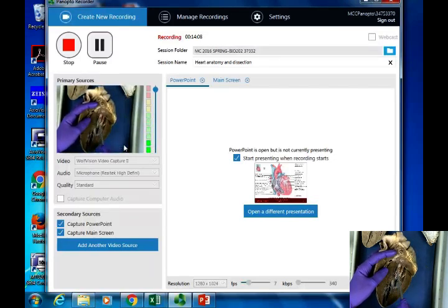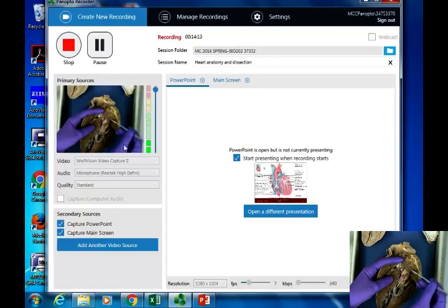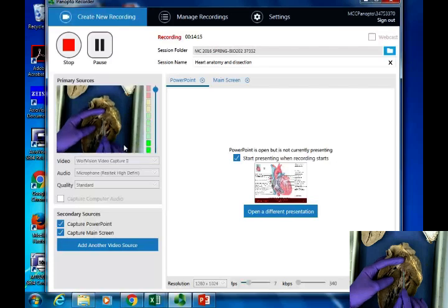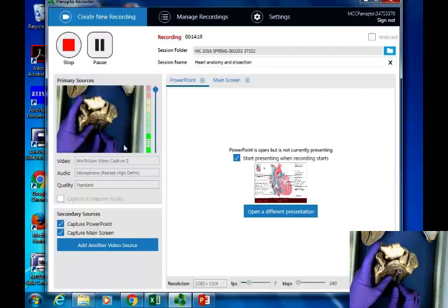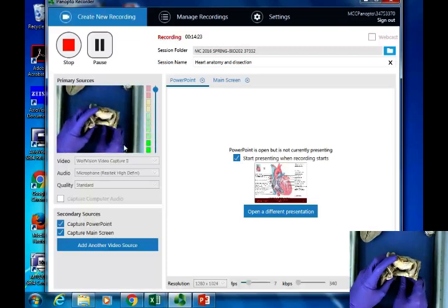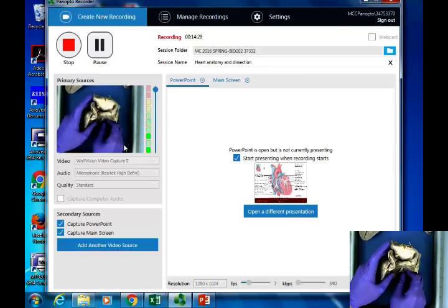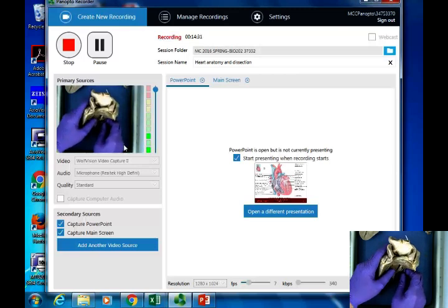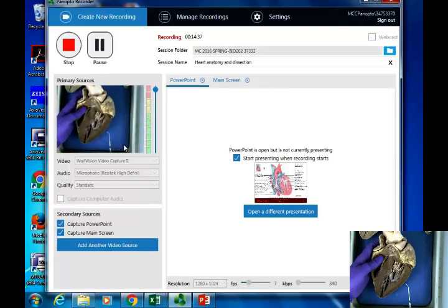So this is going to be the aortic valve up here. It's kind of hard to see because it's way up here, but my pointer here is extending up towards it. So that's going to be going up, up, up, up. Ooh, there we go. See, it's coming up out of one of those branches of the arch of the aorta. Okay? So when you're doing the dissection, you could do that as well. Use your probe or your finger or whatever to follow some of these pathways so that you can figure out kind of what you're seeing.